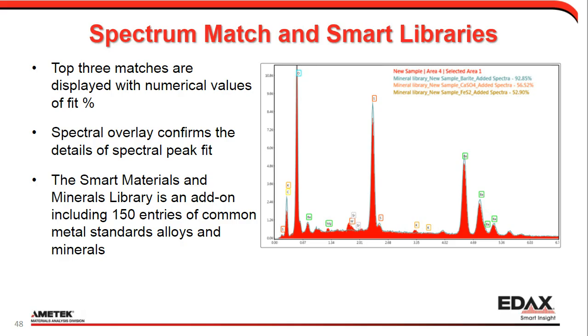Spectrum match is very useful, for example, for contaminant analysis. If you need to identify a bunch of contaminants from unknown samples, you can collect spectra from these contaminants first and build a library. Then you can run spectrum match to compare unknown samples to the library. It will tell you what it is, instead of doing quant and comparing how close those numbers are over and over again.